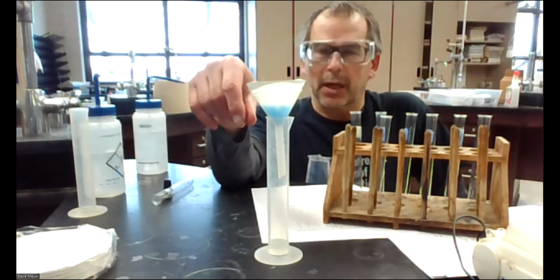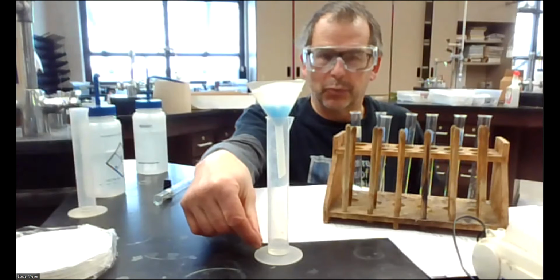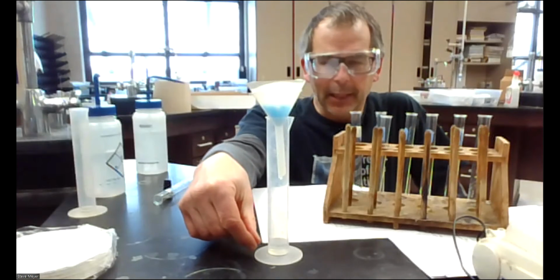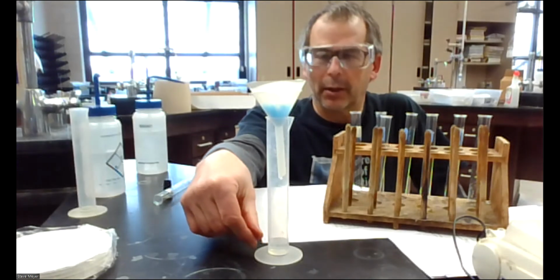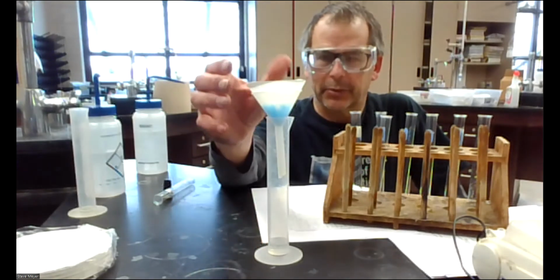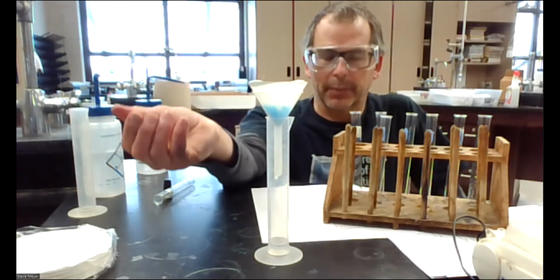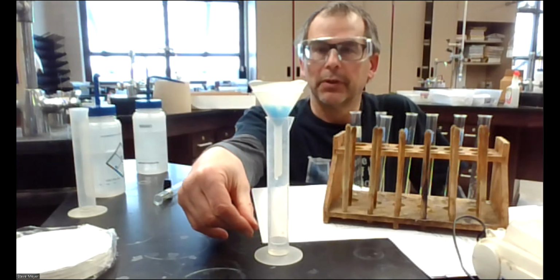Now notice the color of the filtrate. I don't know if you can see it, but it is clear in test tube 1, and that is expected if you look at the reactants and think about what might be in excess in this test tube and what color would be the excess reactant, because what's dripping through is the spectator ions from the product, but also any excess reactant that you have.